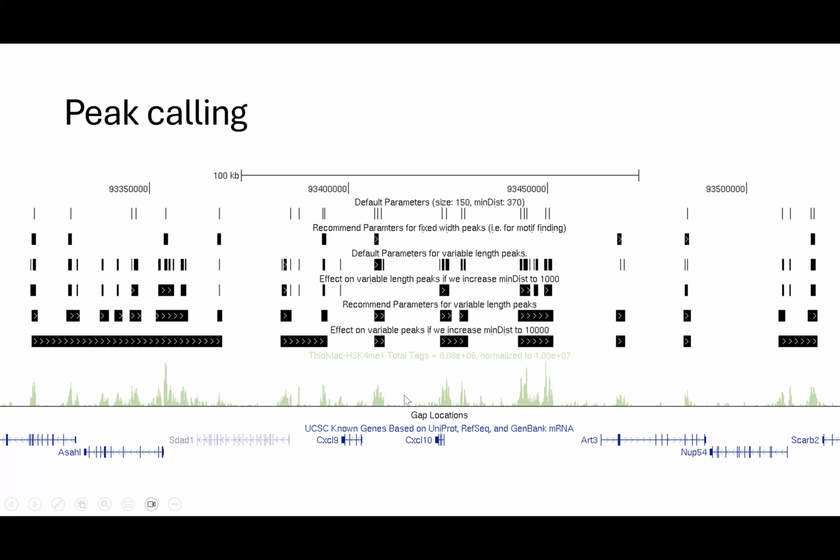And there are regions of the genome where you usually get some signal even in the control, which we would probably want to throw out. So it's not using one set threshold across the whole genome. It's very local to different bins. And that is one of the variables that can change your result: it'll use different bin sizes to decide how big a region to consider for each of the tags, or how much of the local area to consider.